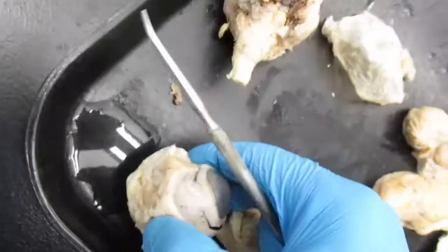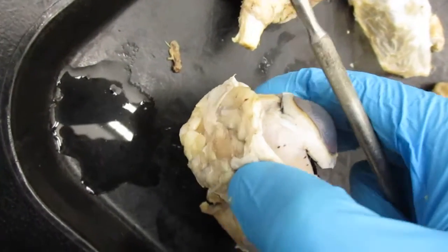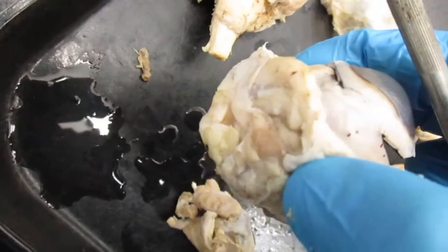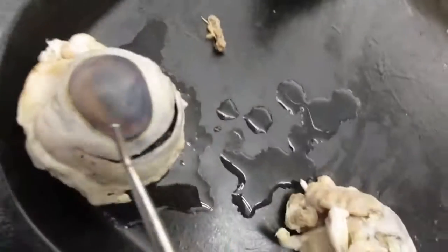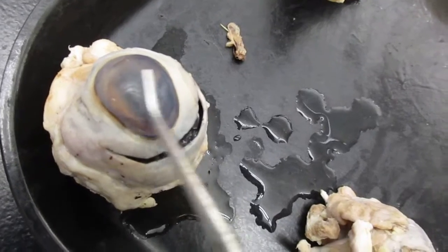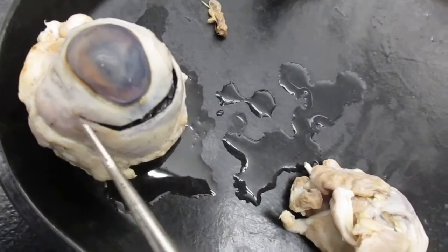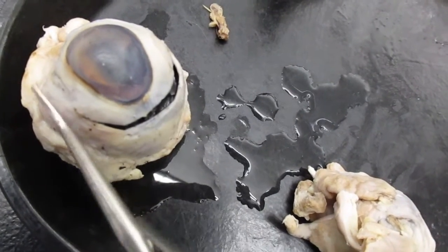Here I have this eyeball that has lots of fat around it, and you can see the tan looking stuff. That's extrinsic eye muscles. This right here is the cornea, a thin translucent structure. Cornea. This white structure here is the sclera.